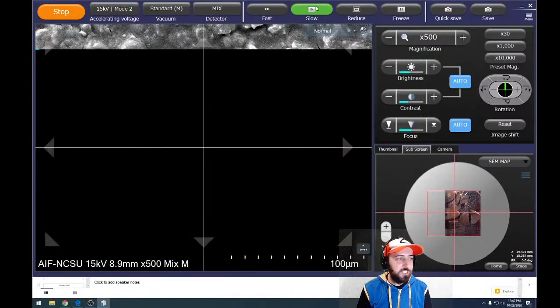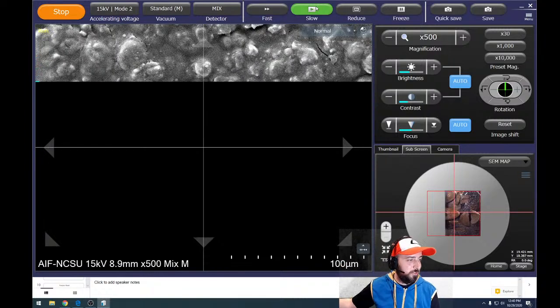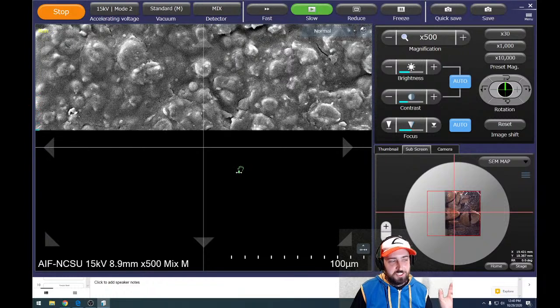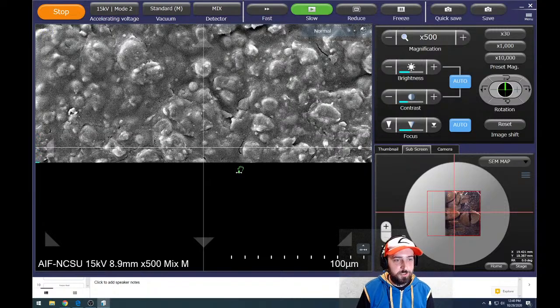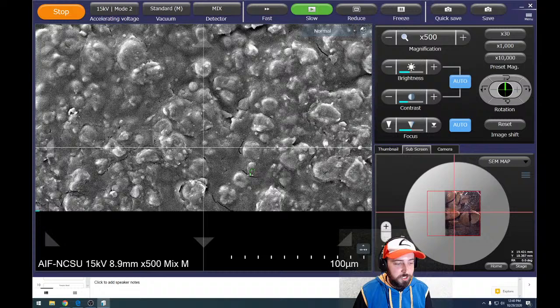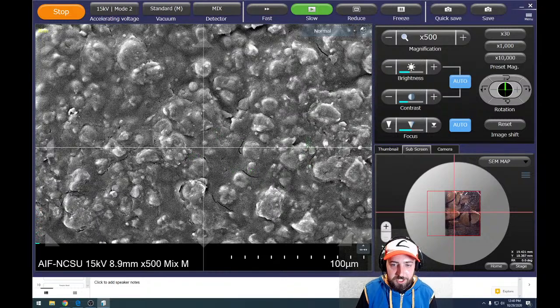Now, remember again the massive size of the crystals that we were looking at in the regular table sugar and the turbinado sugar. We were just at a magnification similar to what we were looking at there. And it's so much harder to see those crystals right here, but they're there. They're these tiny little crystals. And these globules may also be gelatin or other things that they use, but the very bright, sharp things are the crystals.